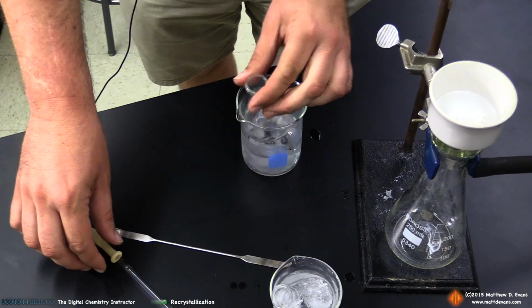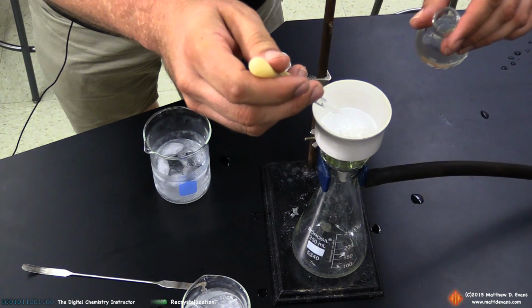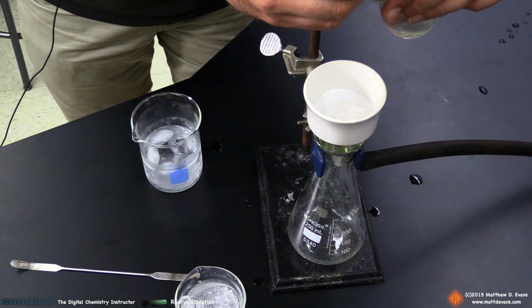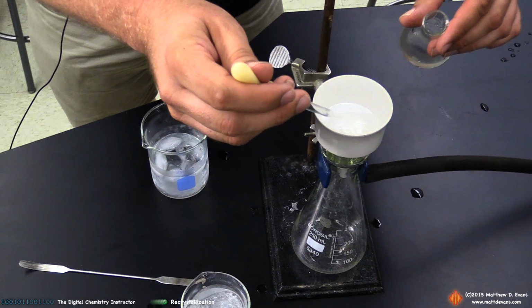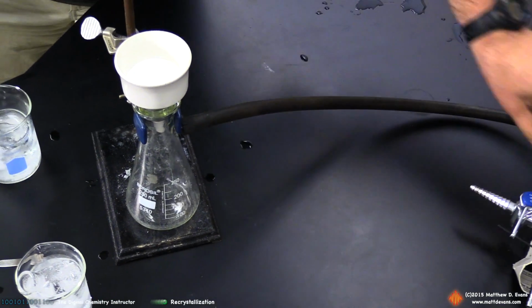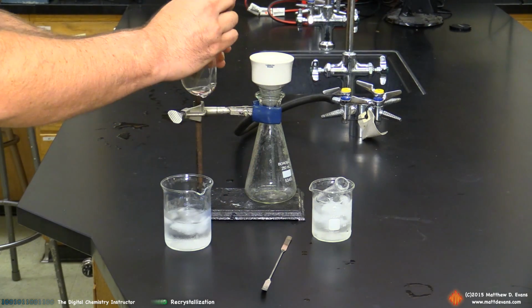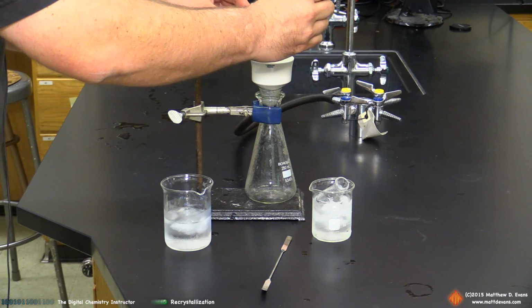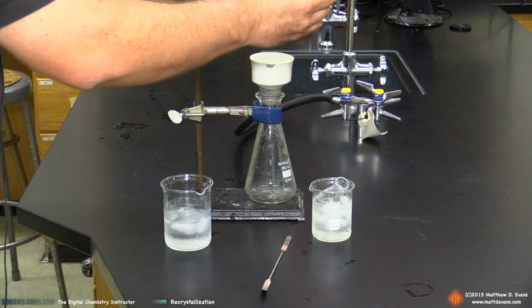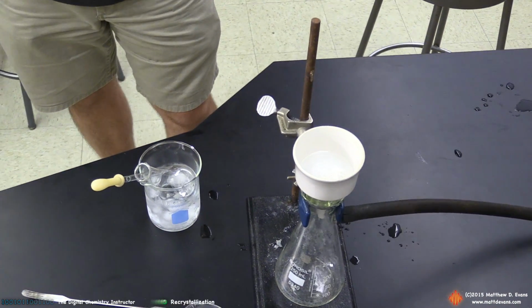Next step is to rinse the crystals, so take more of your ice cold solvent. And the idea here is with the vacuum off, you're just going to put enough cold solvent on top of these crystals just to rinse them. So again, sparingly. You don't want to add too much solvent to this, because more solvent means more dissolving of the crystals. Okay, again, the vacuum's off. Now I'm going to turn it back on. Rinse that solvent through. I'm going to do one more rinse. Vacuum off. Ice cold solvent. Vacuum back on. Okay, that's 2 rinses with our ice cold ethanol.